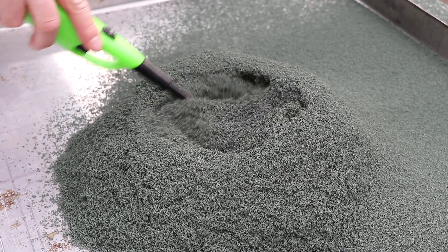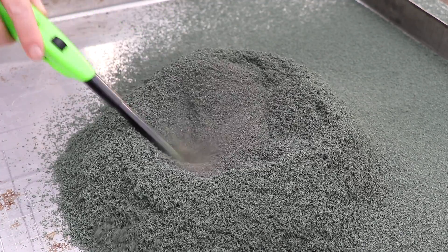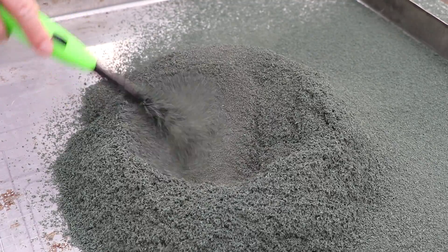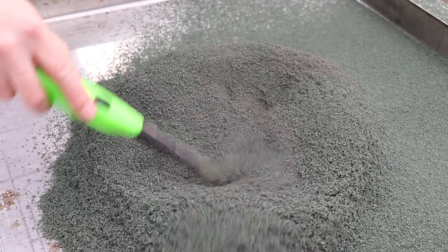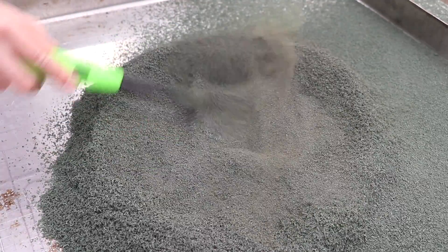Look at that. Oh, it's still hot. See what's on the bottom there. Nothing. It just becomes this powder.